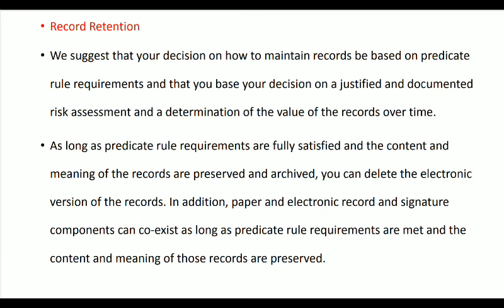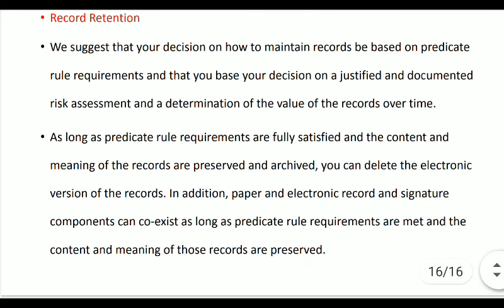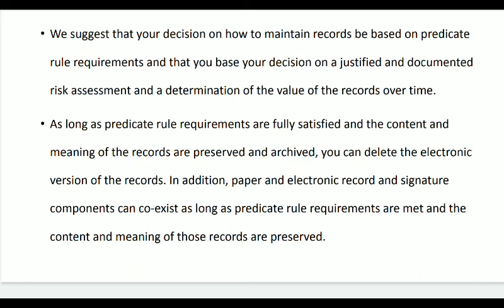As long as predicate rule requirements are fully satisfied and the content and meaning of the record are preserved and archived, you can delete the electronic version of the records. In addition, paper and electronic record and signature components can coexist as long as predicate rule requirements are met and the content and meaning of those records are preserved.